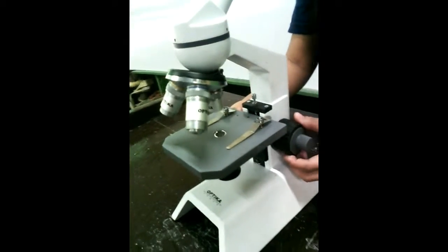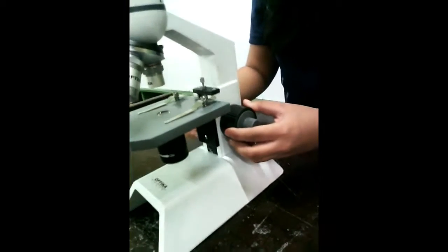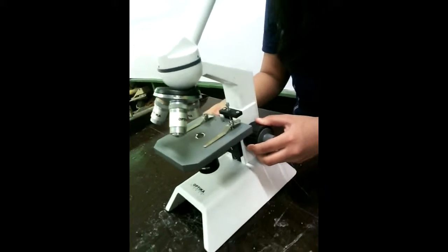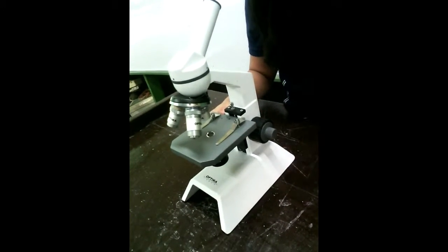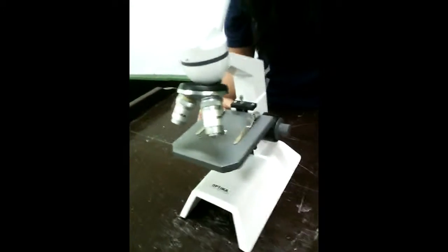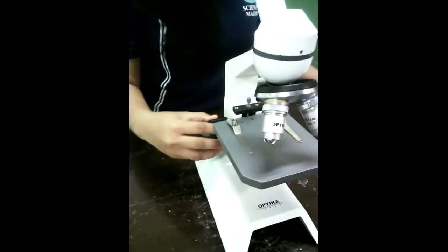This is the coarse adjustment knob, the upper larger knobs used to bring an object into focus only while it is being viewed under the low power objective or LPO.